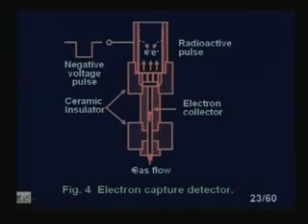Now, the electron capture detector has two electrodes with the column effluent passing between. One of the electrodes is treated with a radioisotope that emits high energy electrons as it decays, and these emitted electrons produce a large amount of low energy thermal secondary electrons in the gas chromatography carrier gas, all of which are collected by the other, positively polarized electrode.